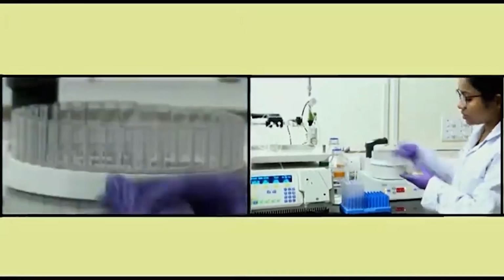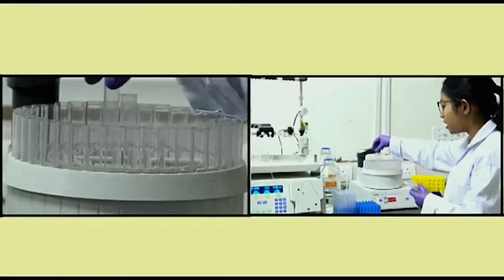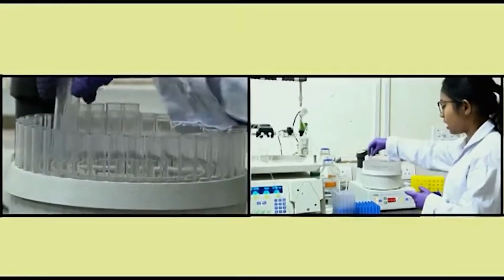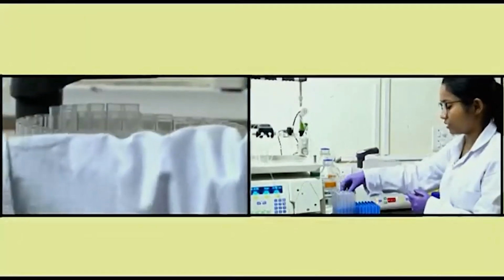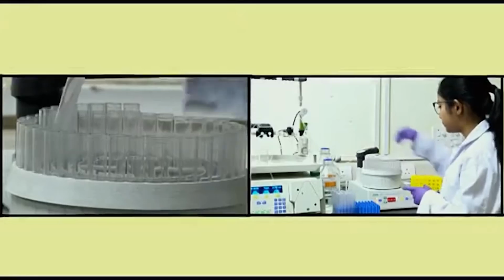The program is running for 21 minutes and I am collecting a fraction every half minute. In each fraction I will have 2.5 ml of sample because at 1 minute, 5 ml of buffer is running.